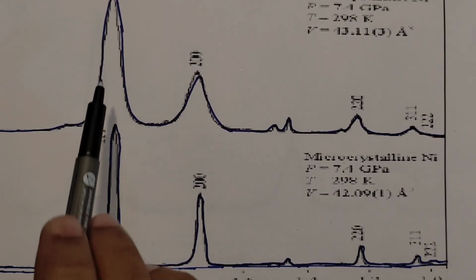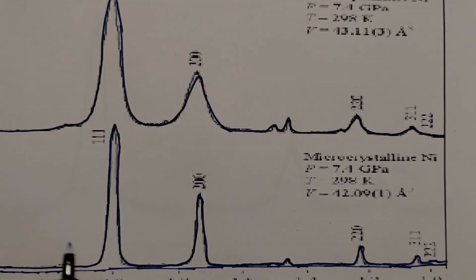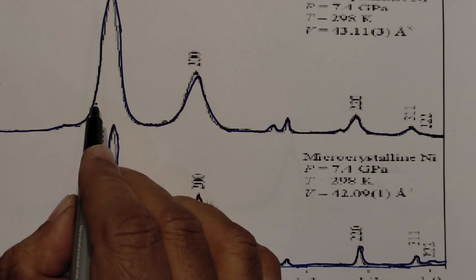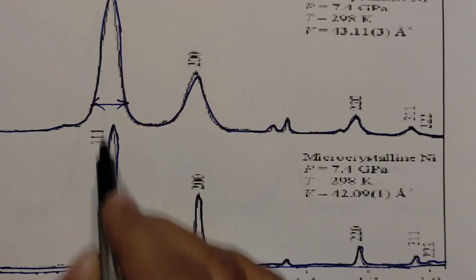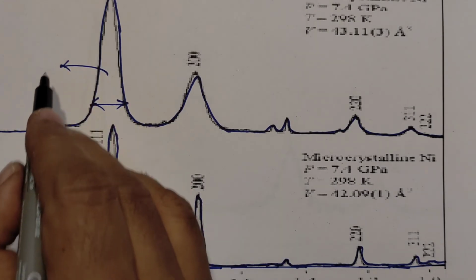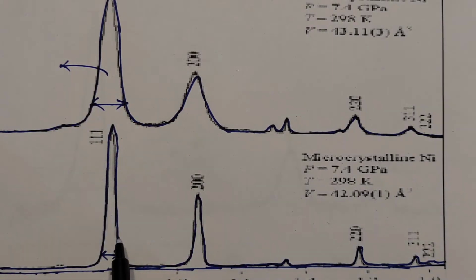See the comparison between the diffraction patterns of the same material. One is sharp and its width is less as compared to this. Here it represents a crystallite size that is less, or nano, and the other is related to the bulk material, that is, crystallite size is more.